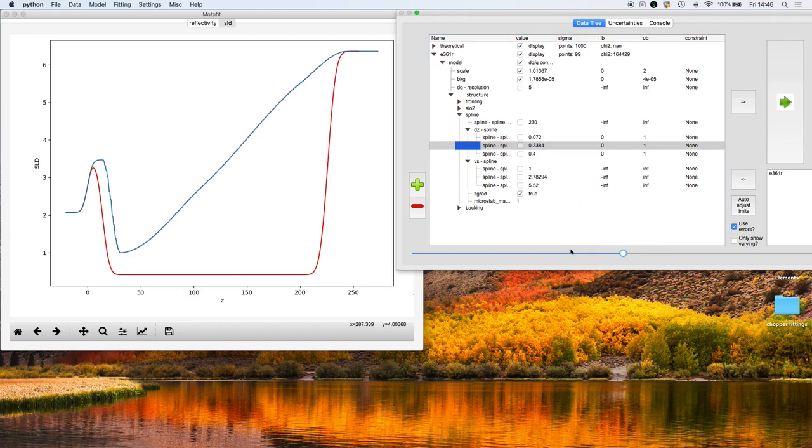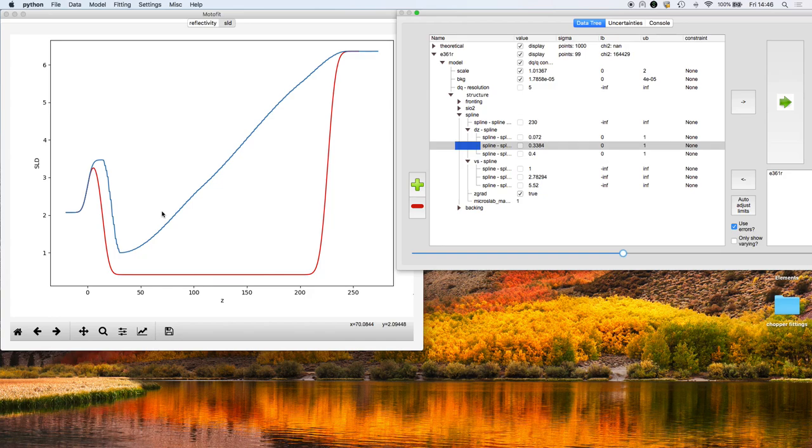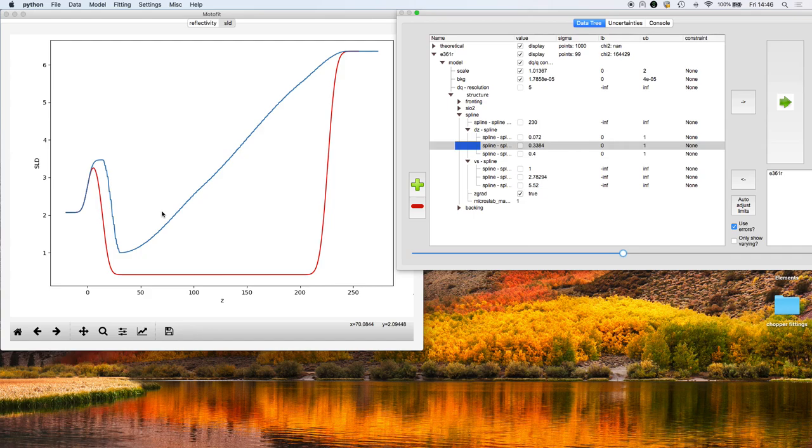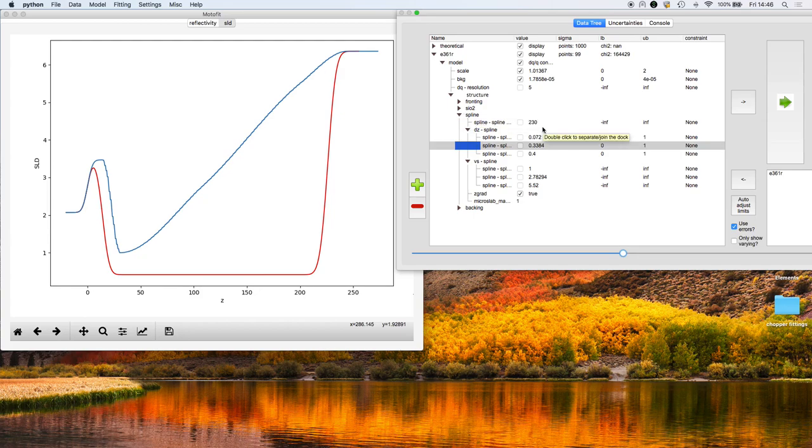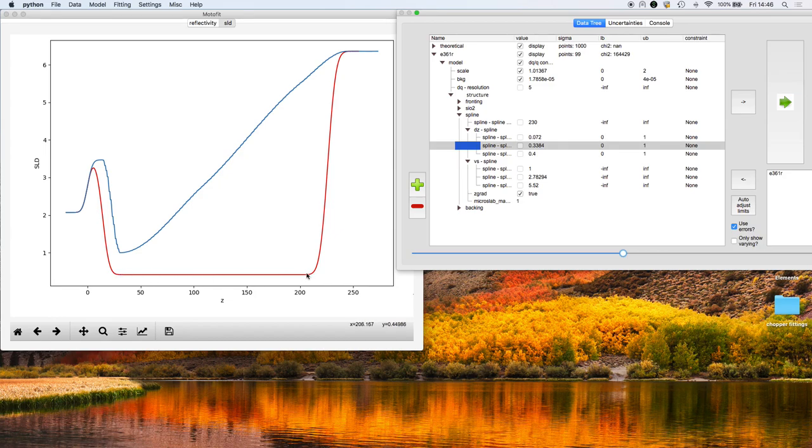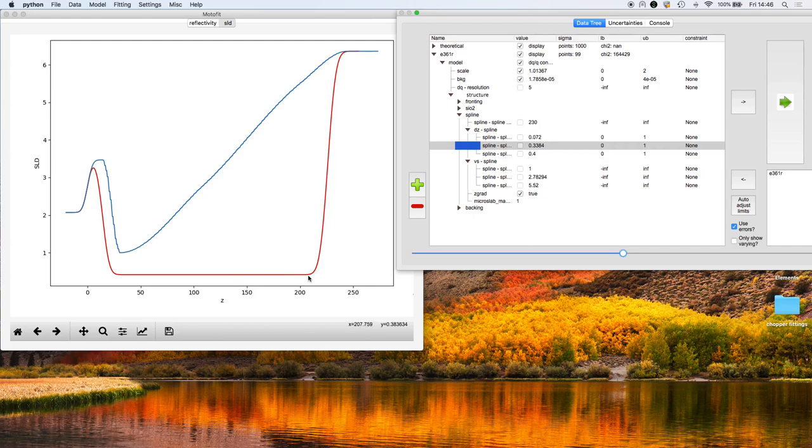If you have a region which you're not quite sure is uniform or can be described by a single slab, sometimes you might use two slabs, three slabs, four slabs to approximate that variation in scattering length density profile. But it's difficult to create a linear profile or something that's smoothly varying. That's what this spline region does.